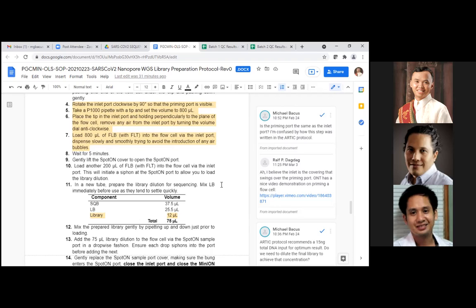In our previous run, two weeks ago, we used a new flow cell. We washed it, and after a flow cell check, we only recovered around 200 to 300 pores. So we think it can only be used once more, and afterwards it will be exhausted. Some other people are saying that you can reuse flow cells up to 4 times, but that's very optimistic. It doesn't look like we can do that for this one.